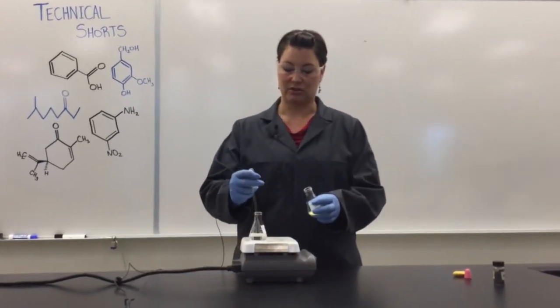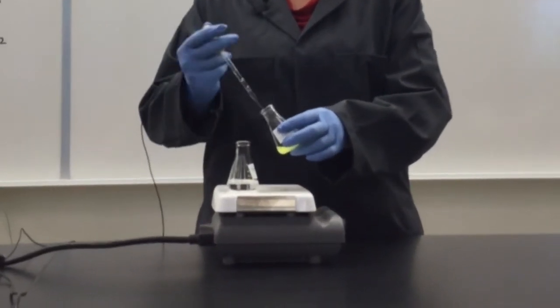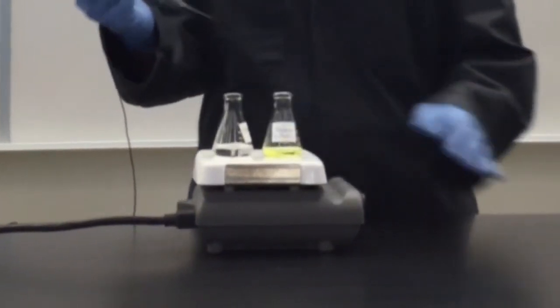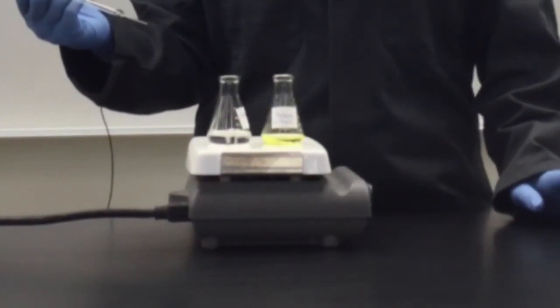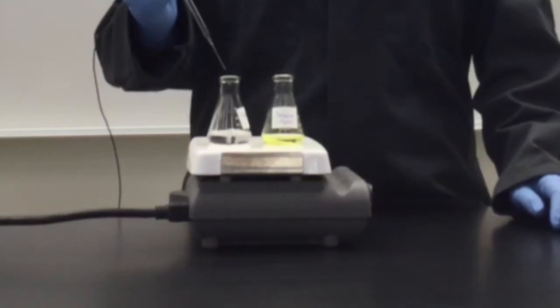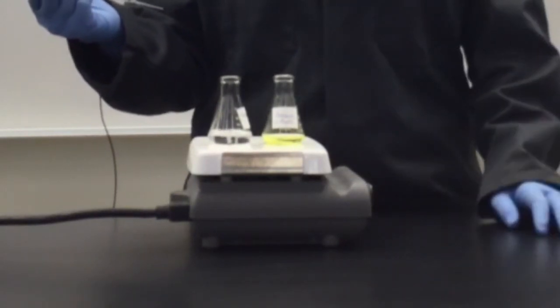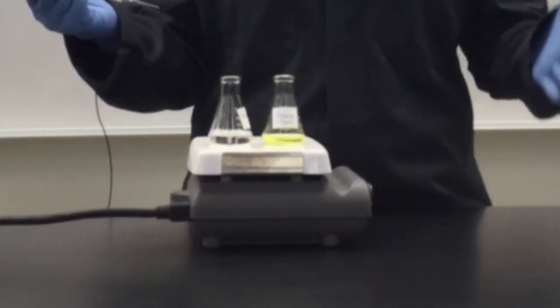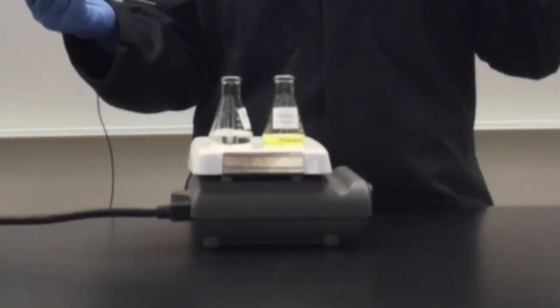So what I'm going to do to start is add a few portions of hot boiling solvent to my solid and ensure that it comes back up to a boil on my hot plate. And then I will continue to add hot solvent until everything has dissolved and I have a transparent solution.